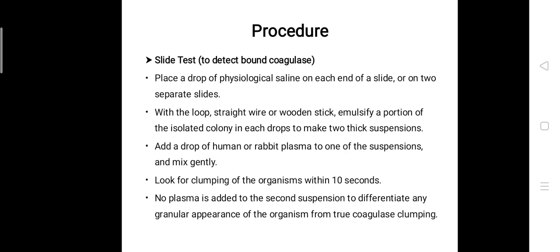The next step is you have to look for clumping of the organism within 10 seconds. But remember, you should not observe for more than 10 seconds because it may give you a false positive result. No plasma is added to the second suspension. This is to differentiate any granular appearance of the organism from true coagulase clumping.